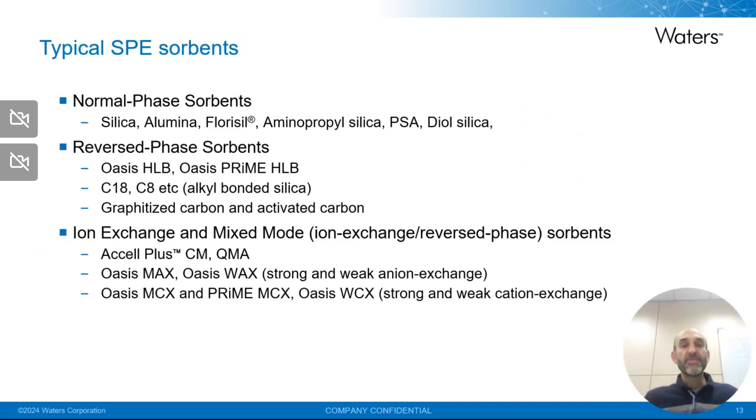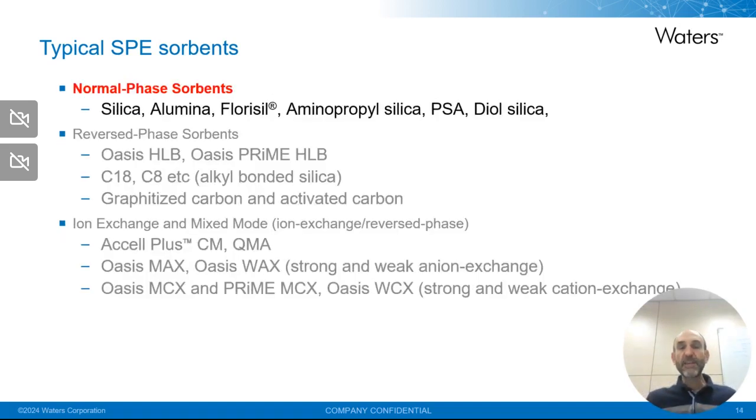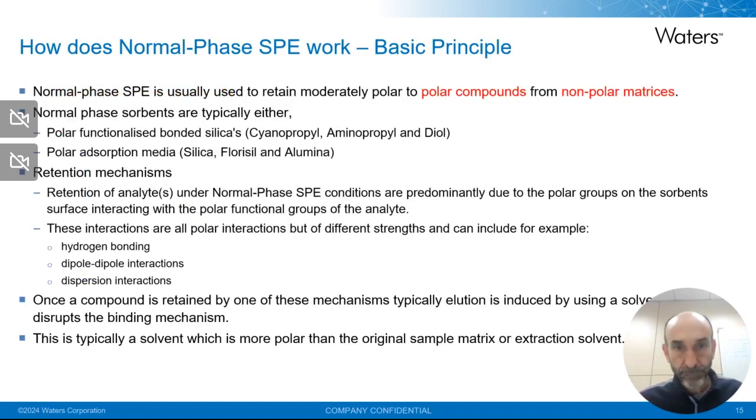So, the typical sorbents can be classified depending on the chromatographic modes that we're going to be working with. So we can speak about normal phase sorbents, reverse phase sorbents, and ion exchange and mixed mode sorbents. Let's speak first about the normal phase sorbents, or about normal phase SPE.